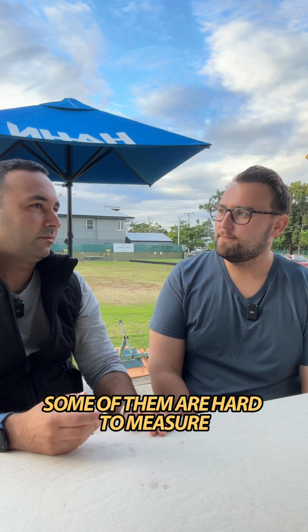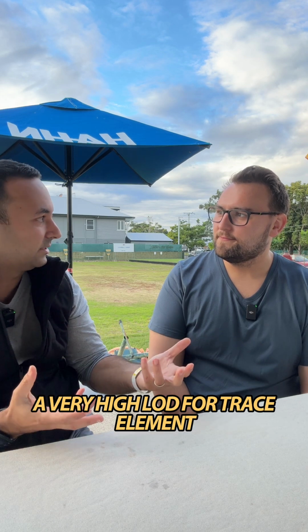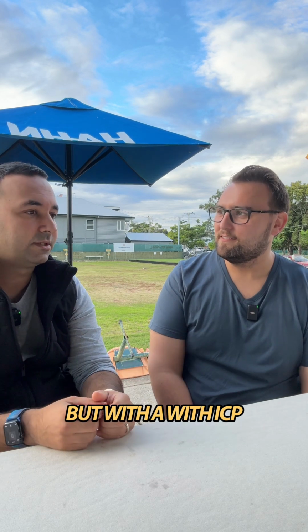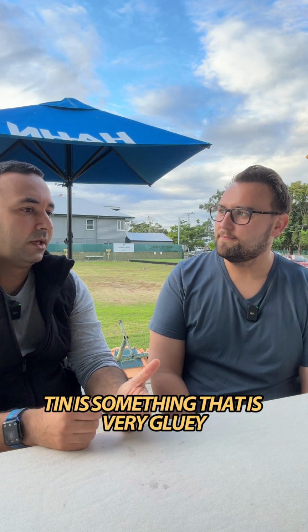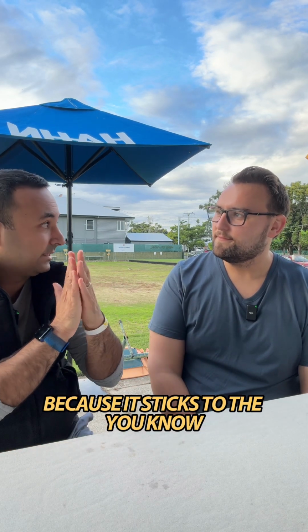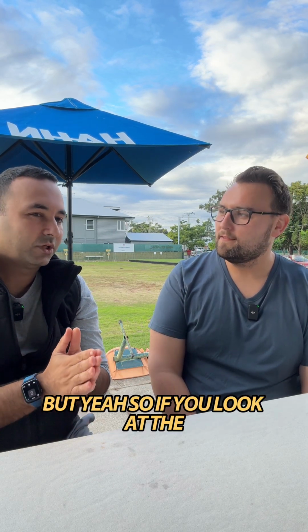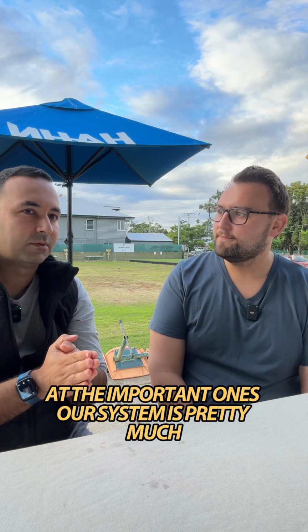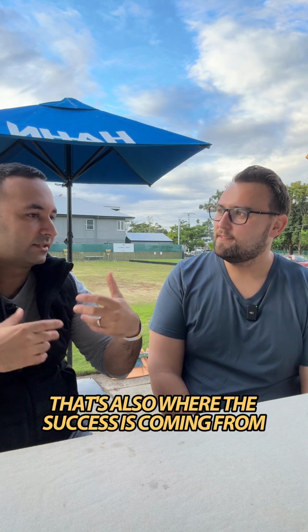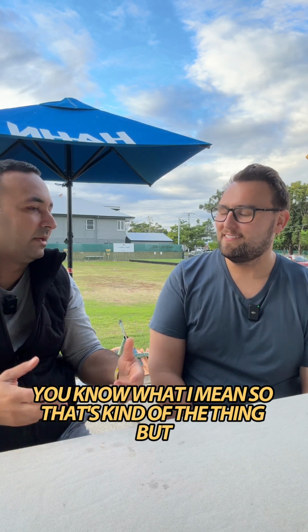Some of them are hard to measure. Things like iodine have a higher deviation, also a very high LOD for a trace element, just because it's a halogen. Fluoride is not measurable at all with ICP. Tin is very gluey, for example, so you end up having problems because it sticks to the vial. There are solutions around it, obviously. But if you look at the important ones, our method is pretty much made to work with them. That's also where the success is coming from. If that wouldn't work, we wouldn't be here.